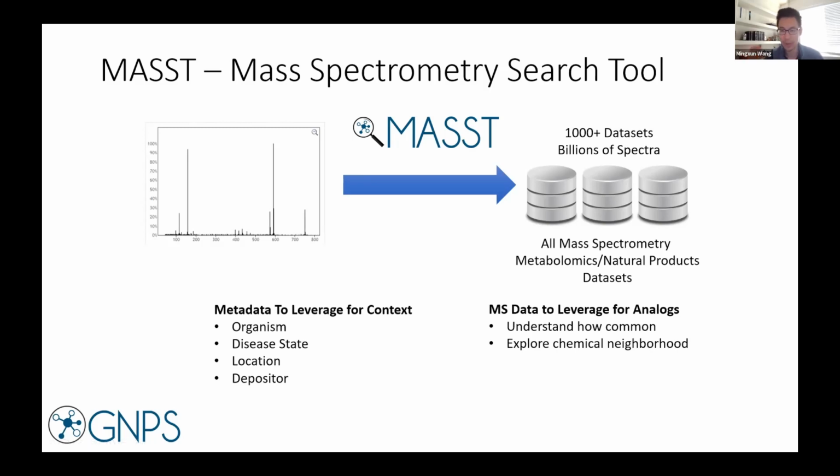And there are different ways that you can annotate this public data as it's going in. That'll tell you the prevalence of this. If you're coming from a natural products perspective, the organism probably matters quite a bit. You want to understand a particular bacteria that's producing an unknown molecule in higher abundance, so you can go isolate it and purify it.